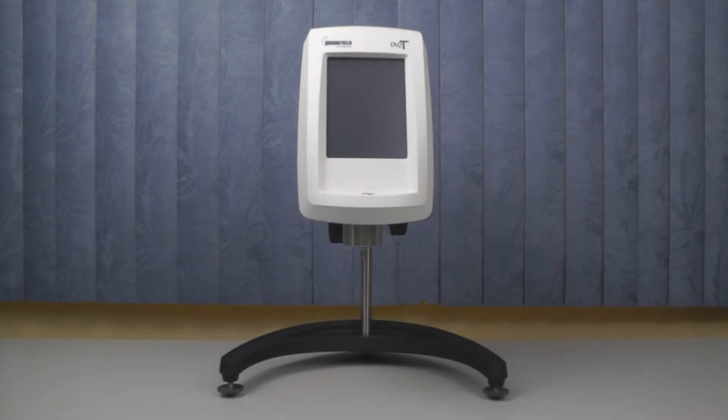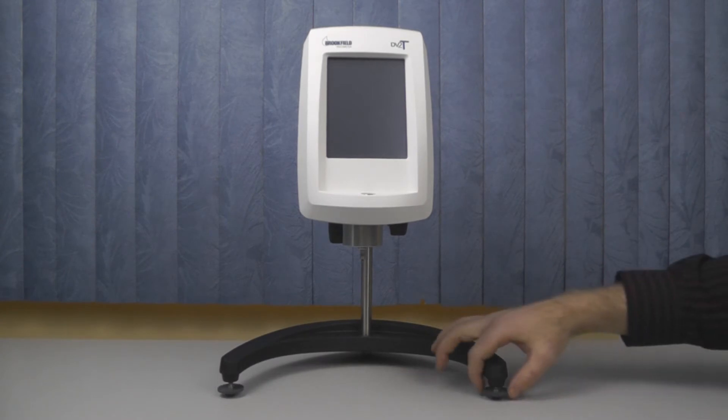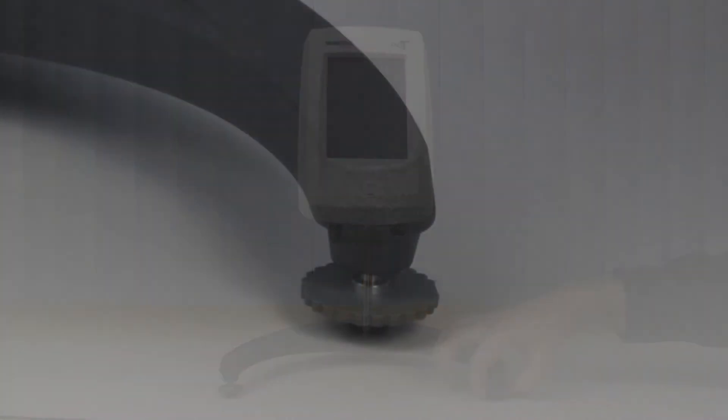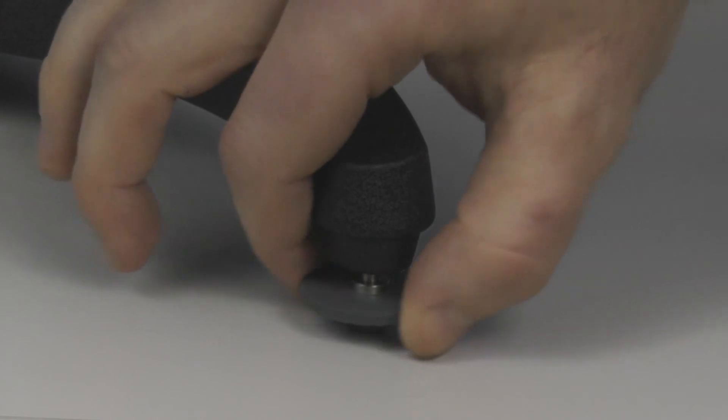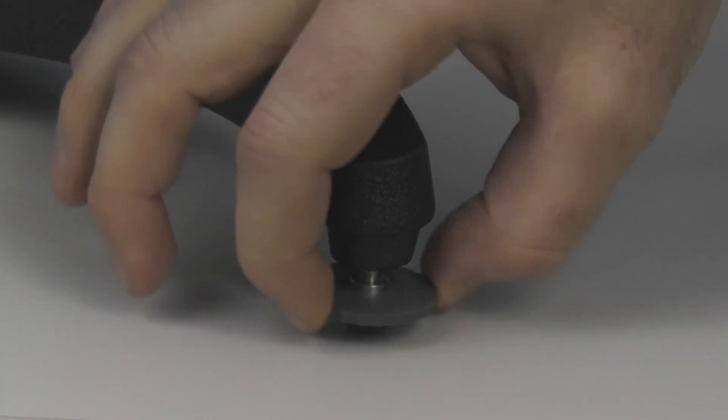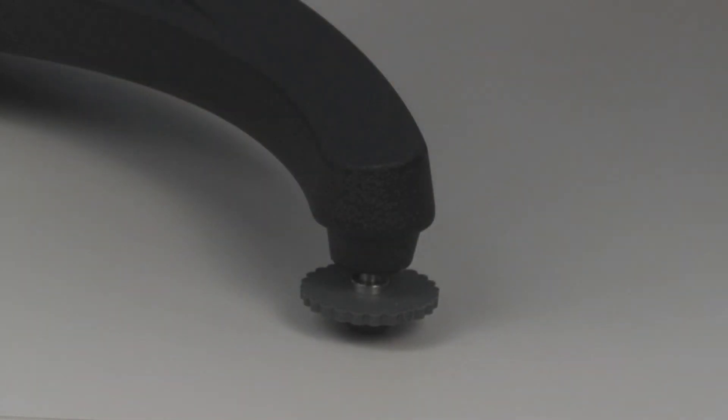You can then fine-tune the viscometer using the leveling screws on the base. Turning a leveling screw clockwise will increase the height of the stand, while turning it counter-clockwise will decrease the height.